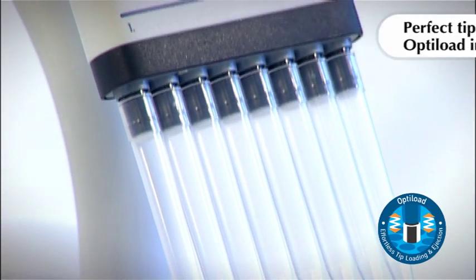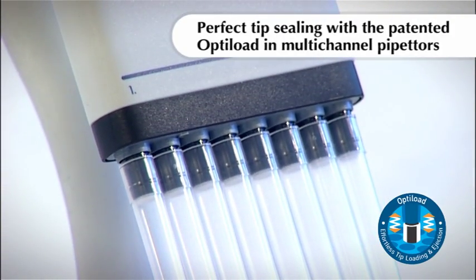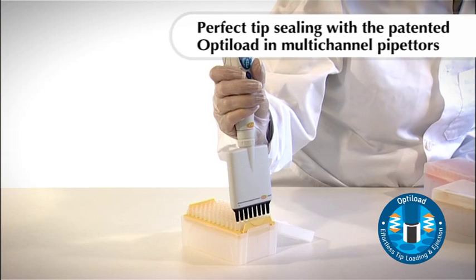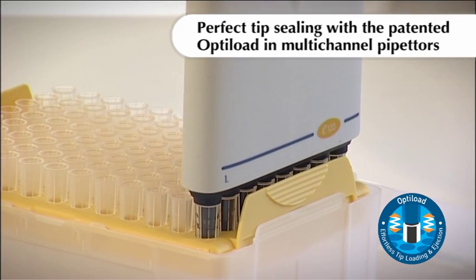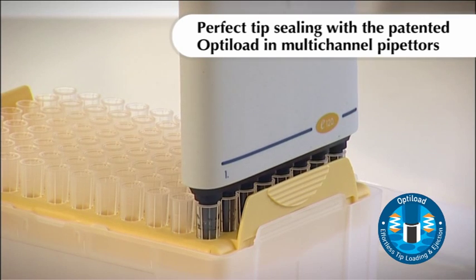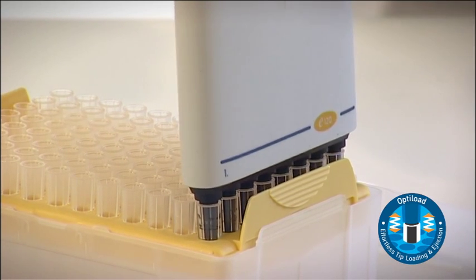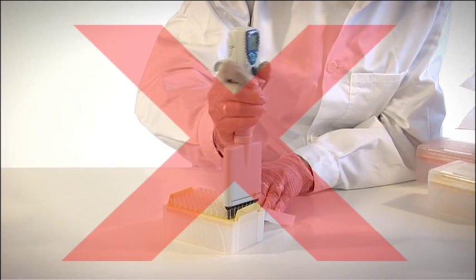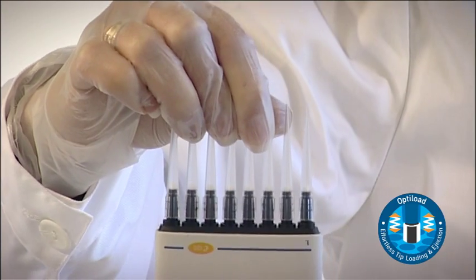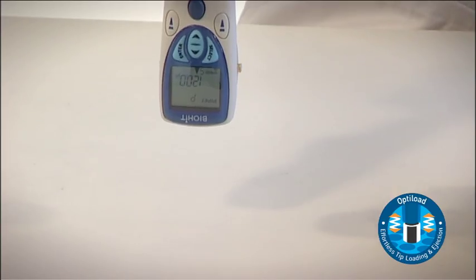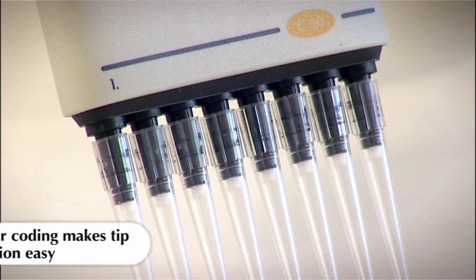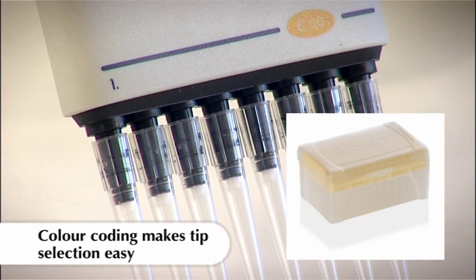The multi-channel pipettes of the E-Line range are equipped with special spring-loaded tip cones. We call it the Opti-Load Mechanism. This mechanism allows tips to be loaded with constant force to every channel without the need to press hard on the tip rack. Opti-Load also enables tips to be perfectly sealed to the tip cone. The color-coding on the pipette makes it easy to find the most suitable tip size.